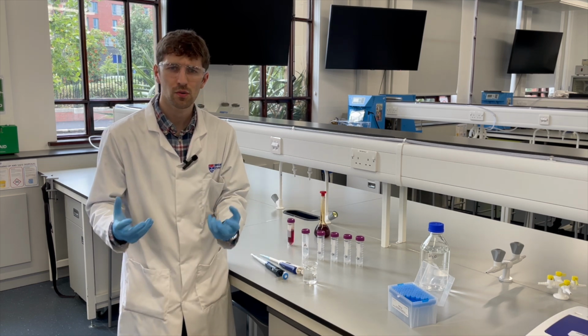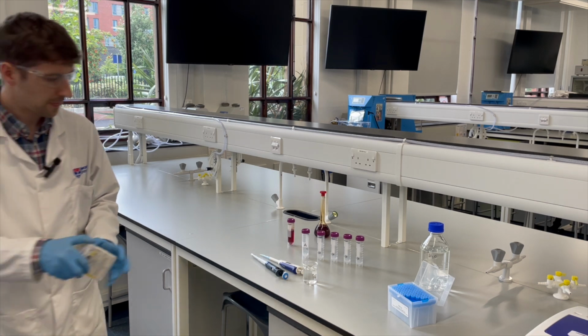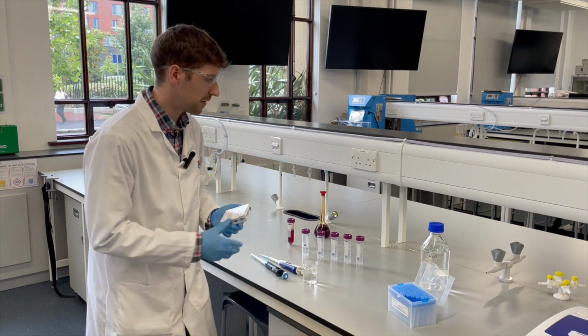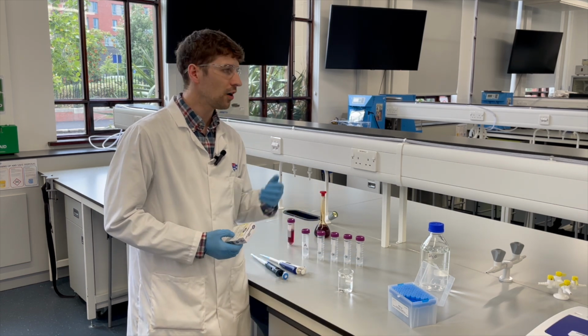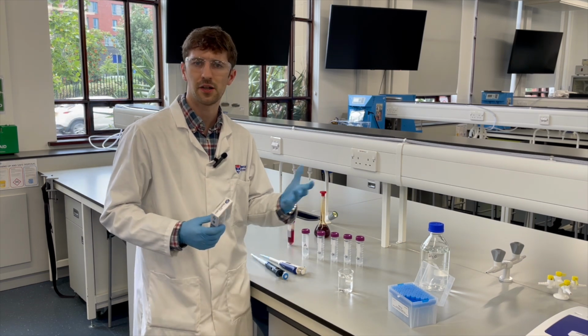Calibration curves are used to relate an experimental unknown to a known quantity or value. So what does that mean? Well, let's say we had some aspirin tablets, and we put them into a beaker of water, and we want to determine how quickly and how much aspirin gets released over a period of time.